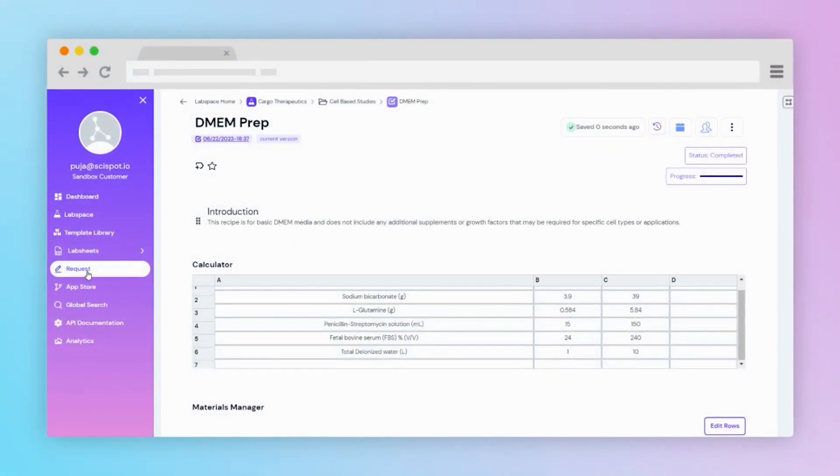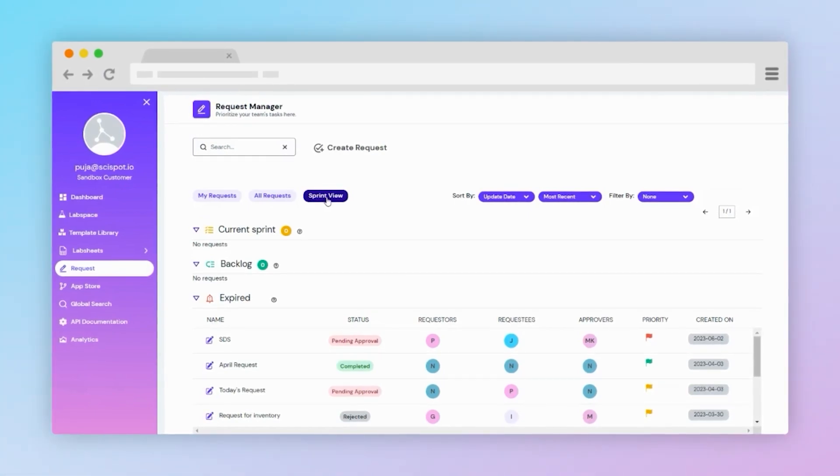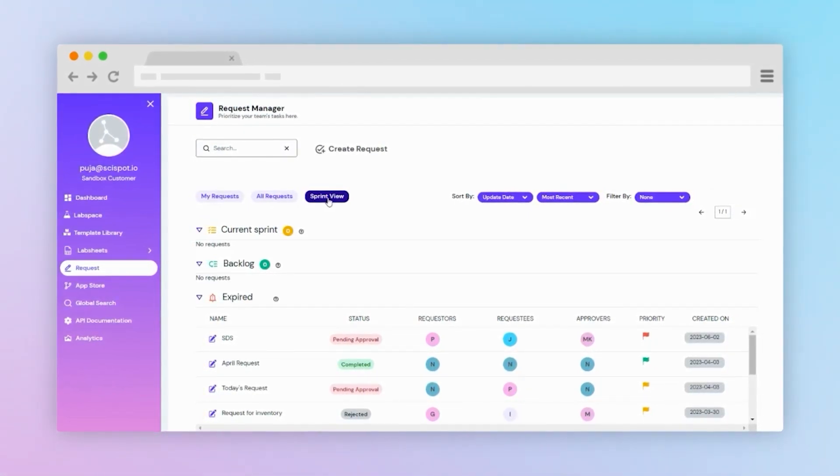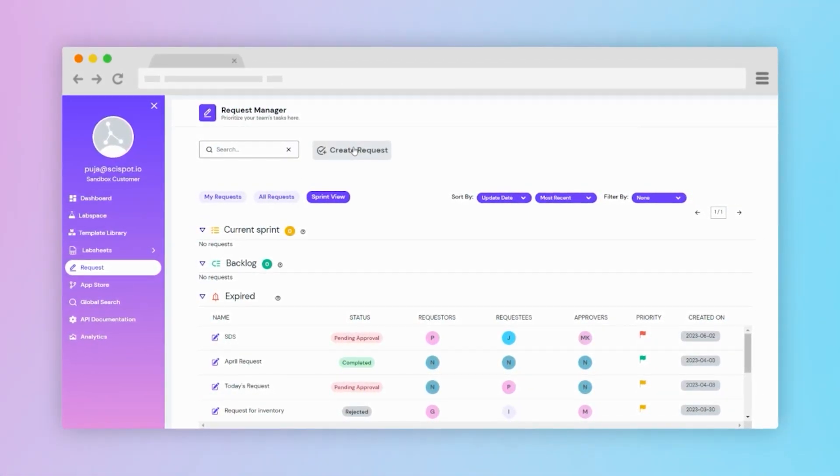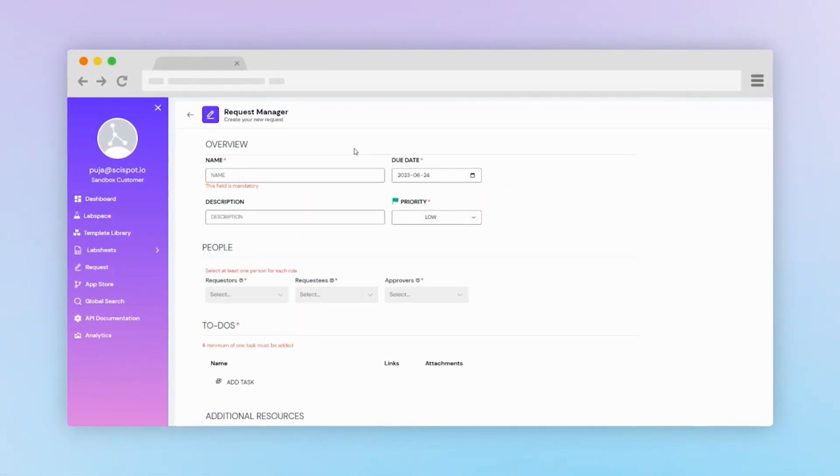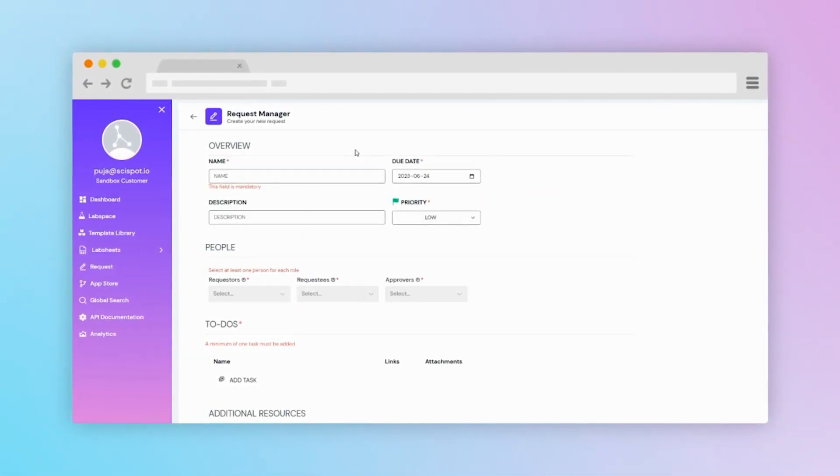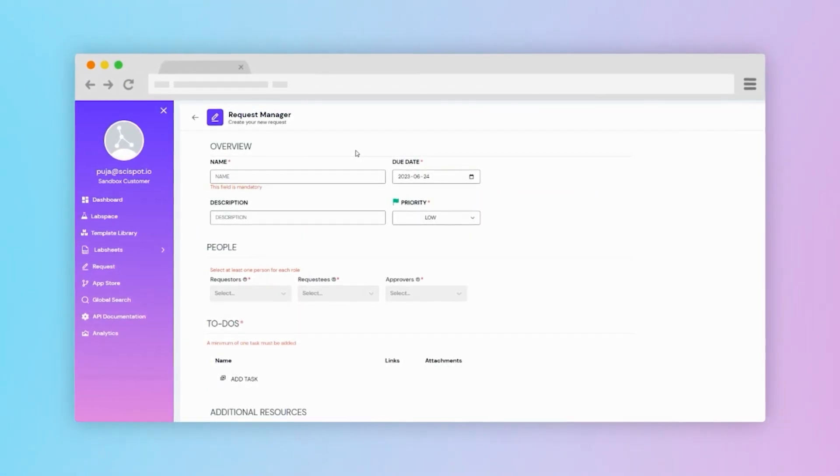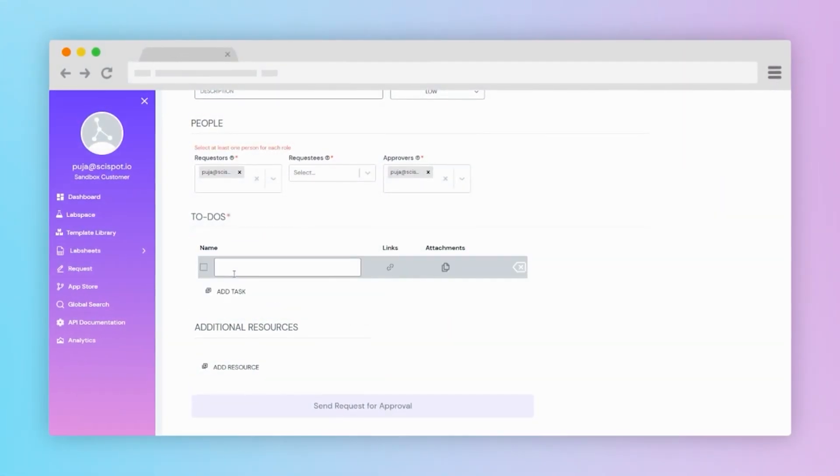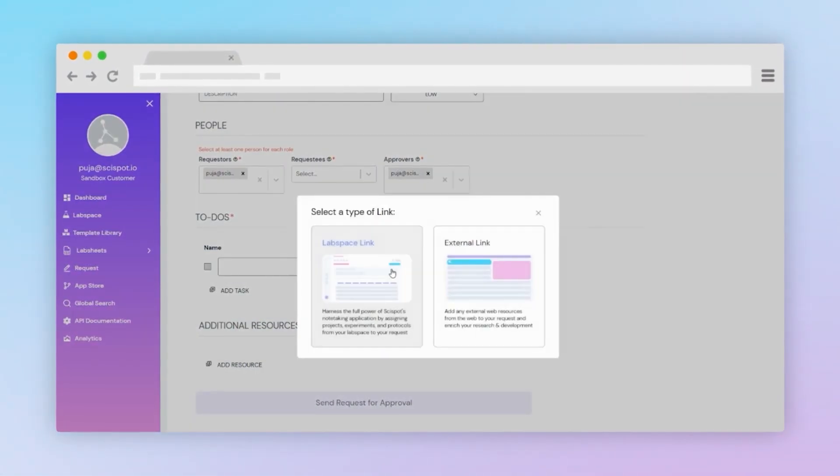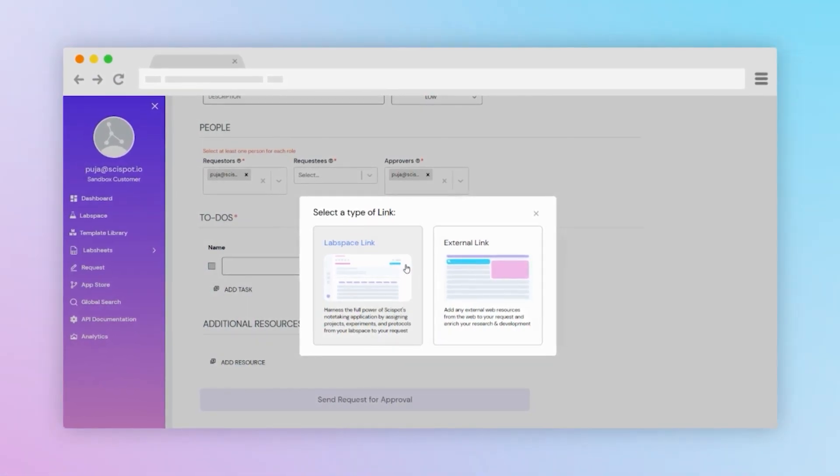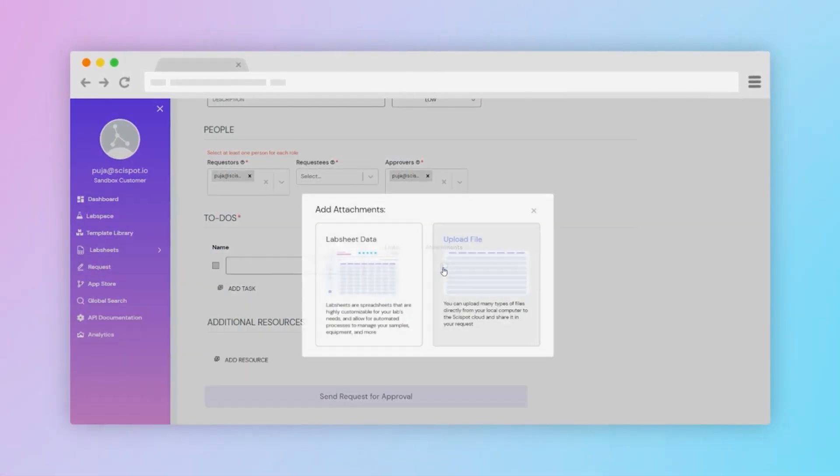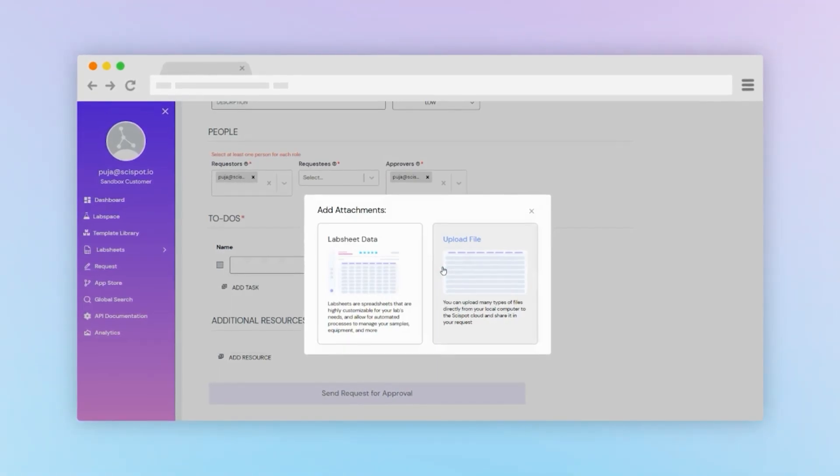SciSpot offers various project management tools. One such example is our request manager. This allows users to handle requests, including requester, approver, and task assignment features. Data from lab sheets and lab spaces can be embedded within requests, streamlining workflows. External resources can also be embedded.